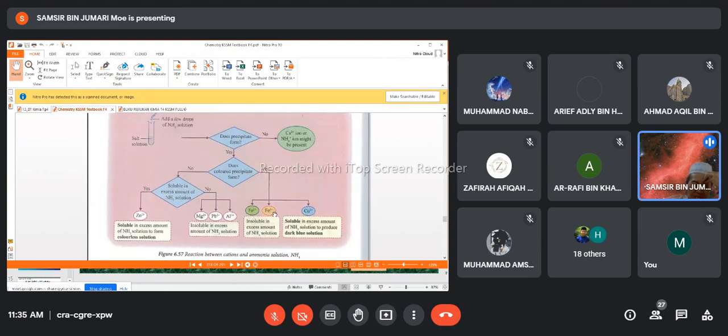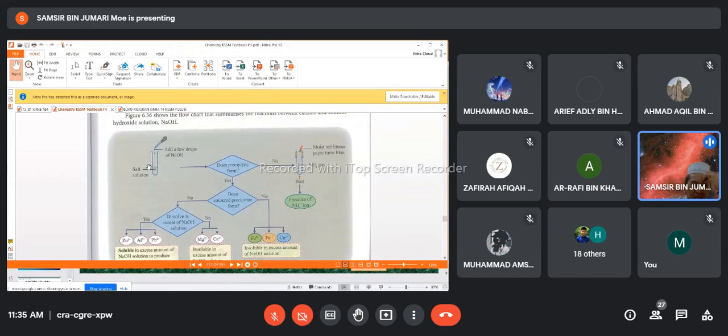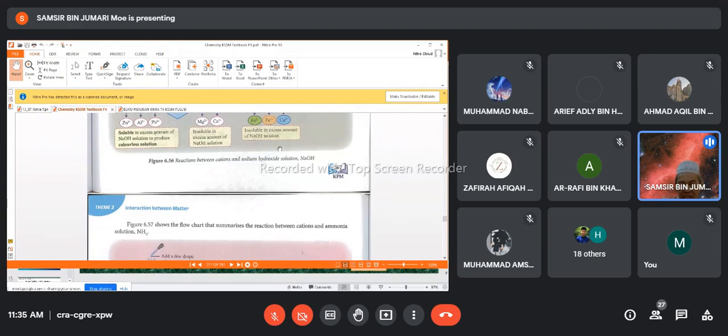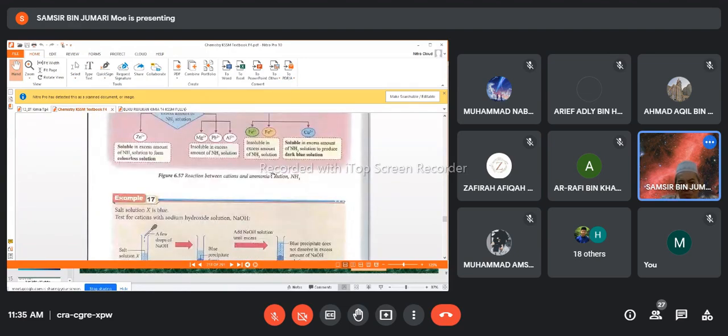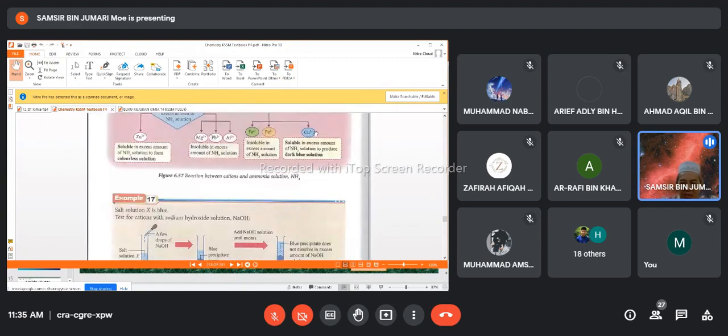Iron 2 ion and iron 3 ion have the same observation as we have known in the sodium hydroxide solution. Jadi iron 2 ion dengan iron 3 ion ni sama dia punya pemerhatian dia yang akan kita dapat kalau kita keduakan kedua-dua ni reagent tu. Jadi ingat yang sebahagian bagi iron 2 ion, iron 3 ion dan copper 2 ion ni mudah kita kenal pasti sebab dia ada warna yang kita boleh dapat lihat dengan jelas. Senang. Okay.